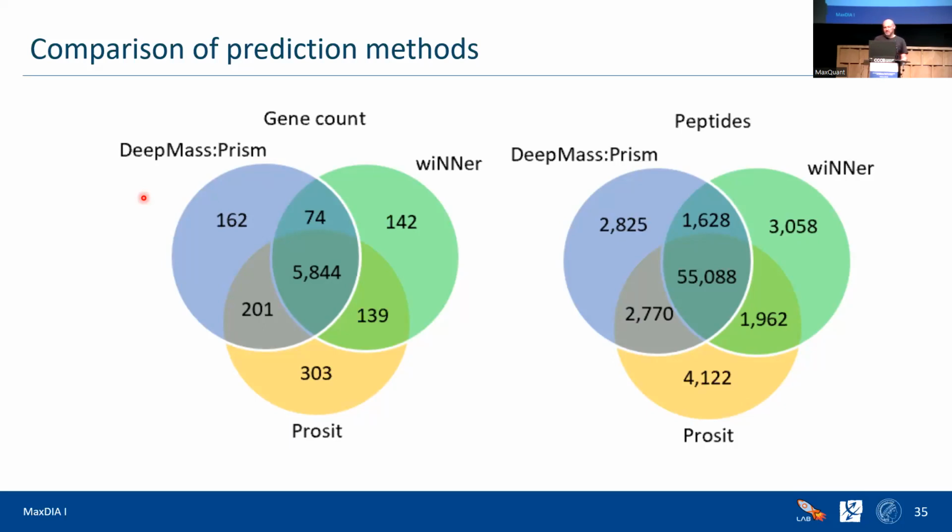And so there is, of course, transfer learning to help a little bit. But what I think is actually even better, I mean, if there are no disadvantages for the simple model, then just take the simple model. And you can just retrain it on any small data sets that you produce in your lab. And so we will see that. We will provide actually a web server for doing exactly this. This is all coming later.